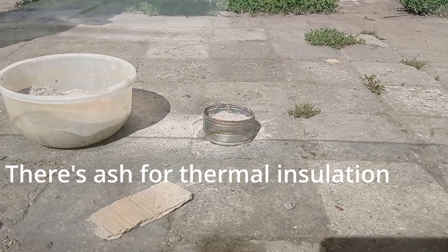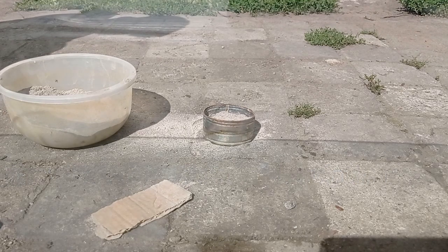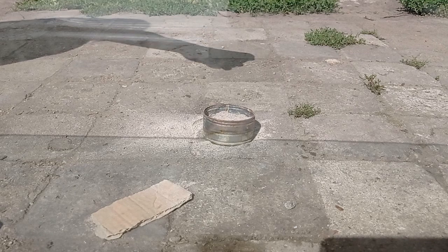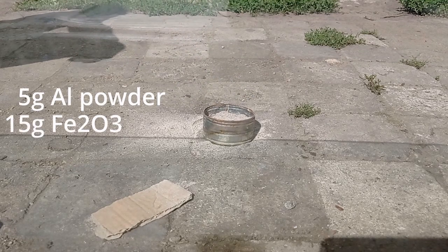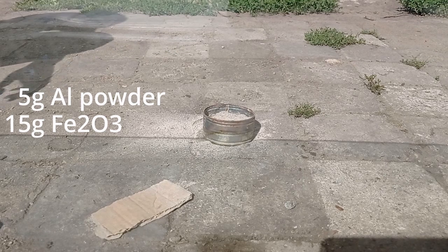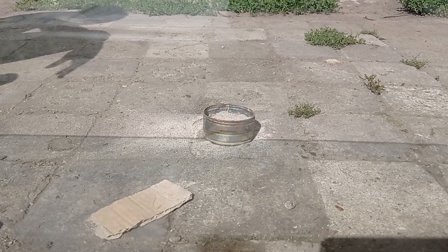Okay, so I'll start with the most common thermite: iron oxide thermite. There's 5 grams of aluminum powder and 15 grams of oxide, so the ratio is 1 to 3.